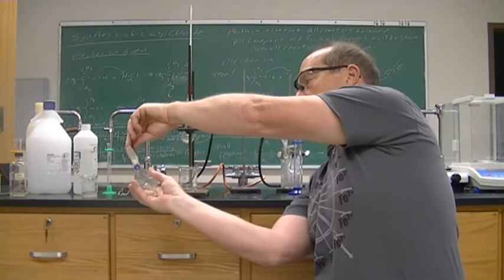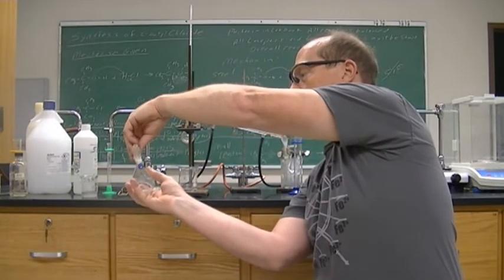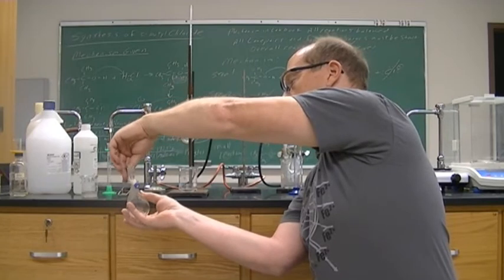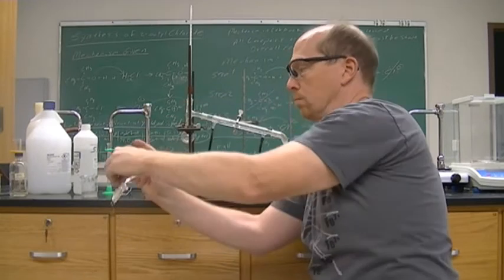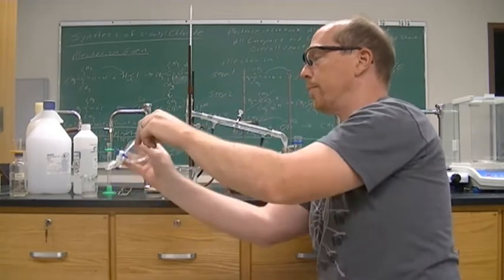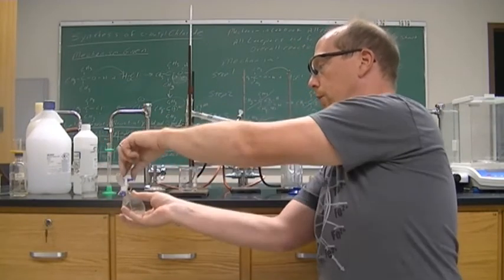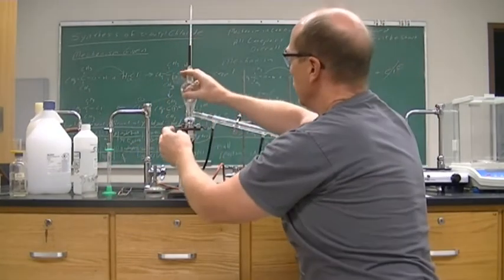You can hear the release of pressure. And again. All right, I meant to switch my hands. All right, and that didn't work. May have lost a little product there. That's all right. We're not worried about our yield. Just making sure we get some. All right, so then we let that separate.